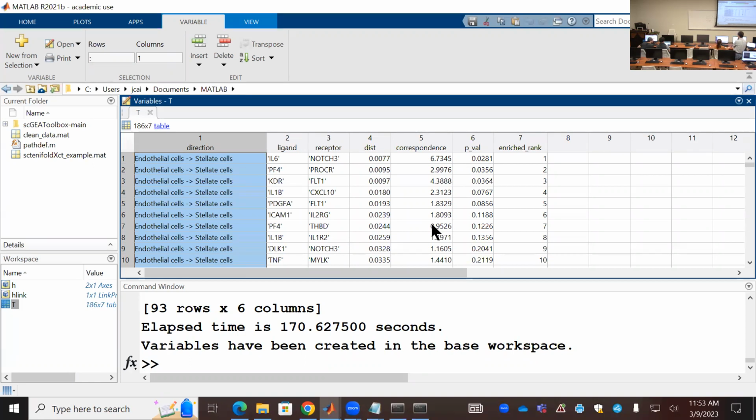I think so. Yeah, it's not exactly this database, but the one we can have, the most comprehensive one. It should be in there.